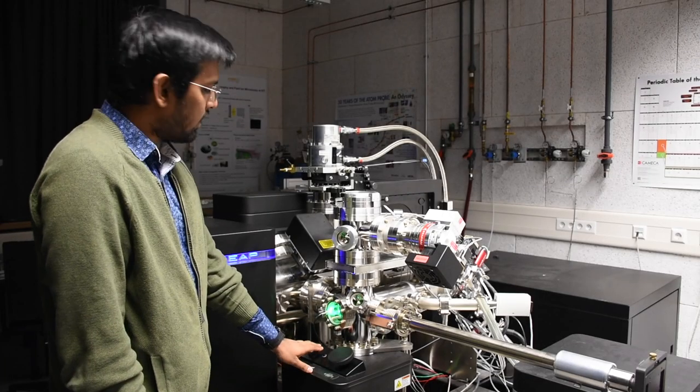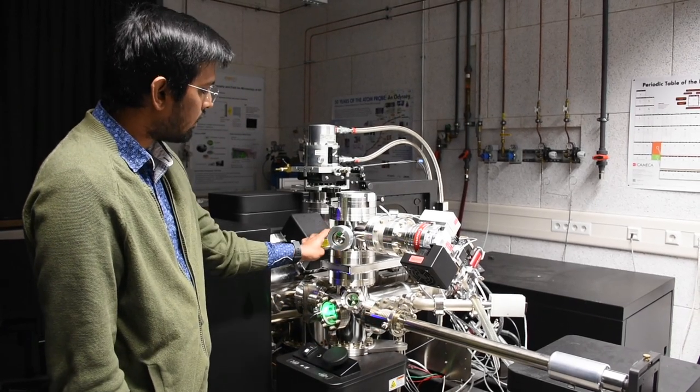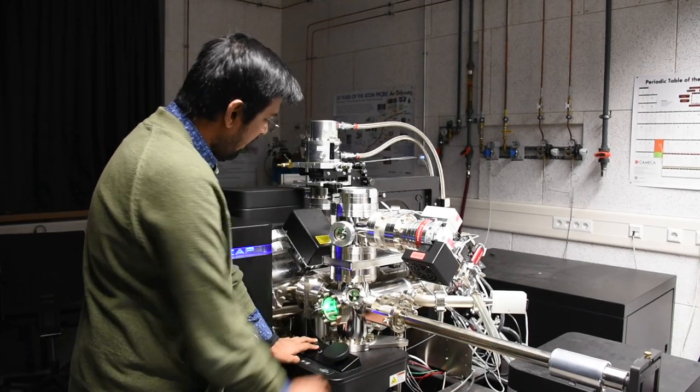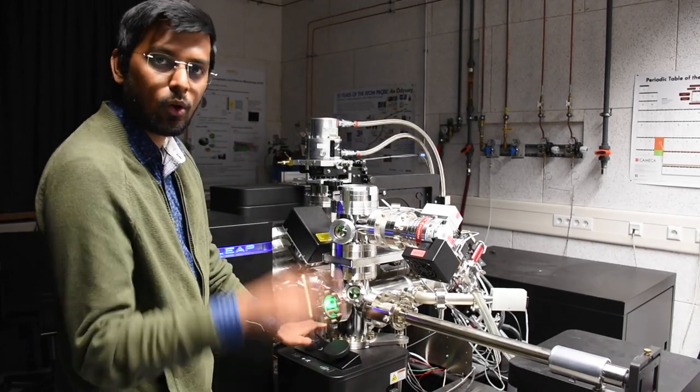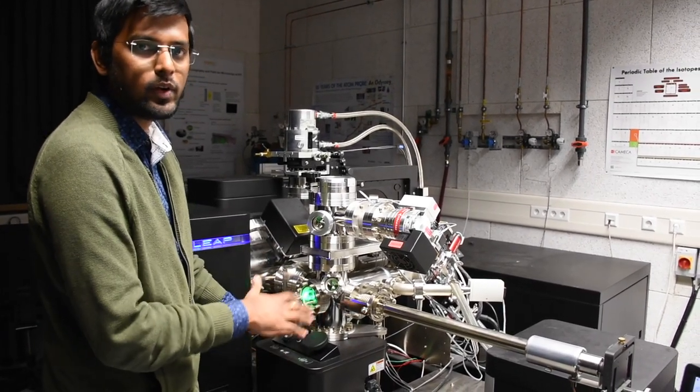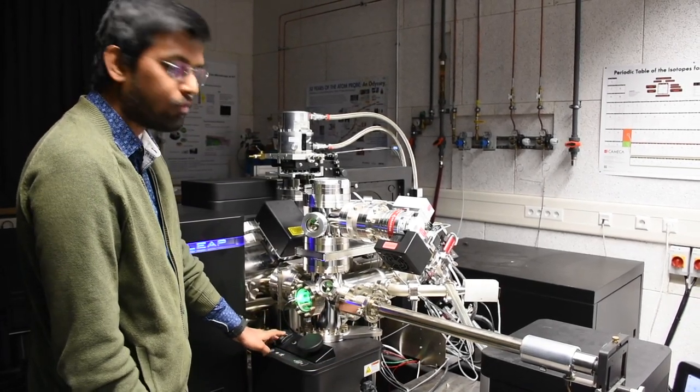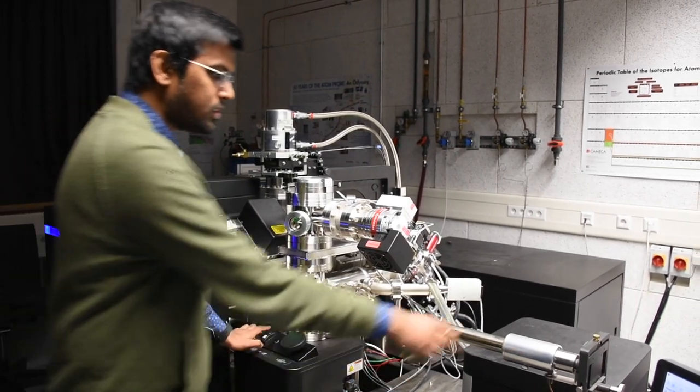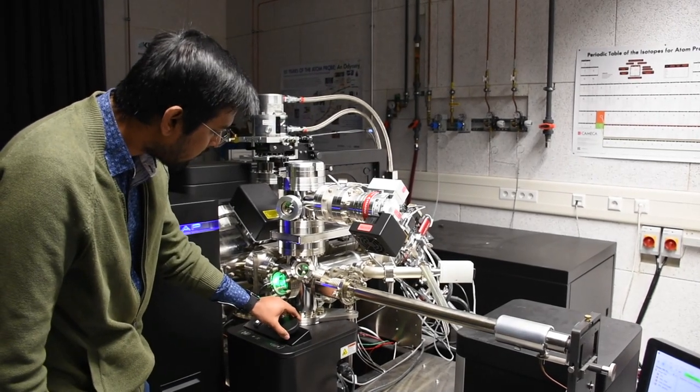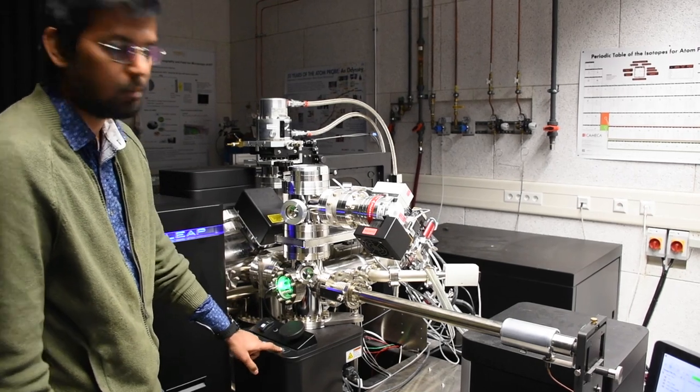So we moved our sample from the load lock to the buffer chamber. The load lock carousel itself was moved to the buffer chamber using this vertical manipulator. Now we are going to move the sample from the load lock carousel to a buffer carousel. We have another carousel because we don't want to expose the buffer carousel to the atmosphere. To move the sample, we use this horizontal manipulation rod while controlling the movement of the carousels using the vertical rotation.